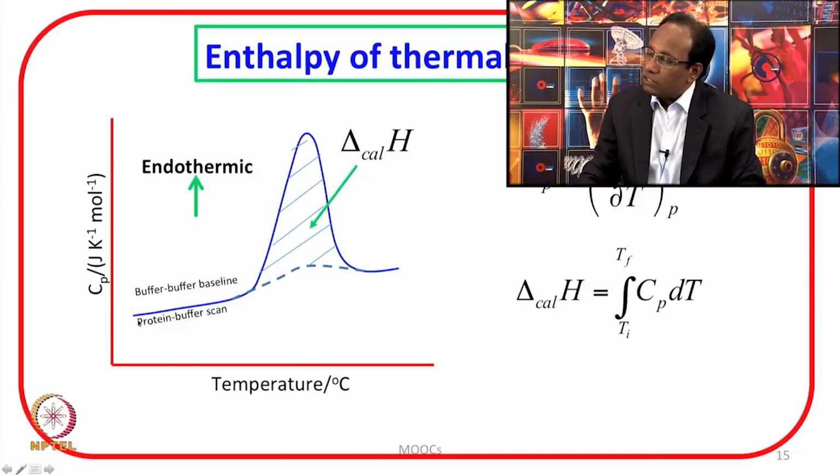And I will soon discuss with you why there is a slope associated in the beginning and why finally also you see some slope, and why this heat capacity variation and this heat capacity variation do not have the same slope. Why does the slope differ? Why is the heat capacity here higher than the value of heat capacity there?